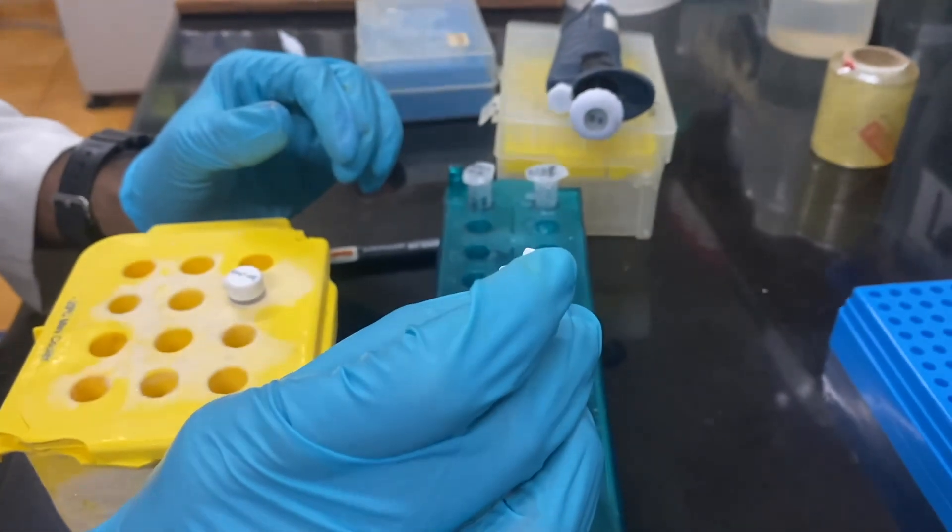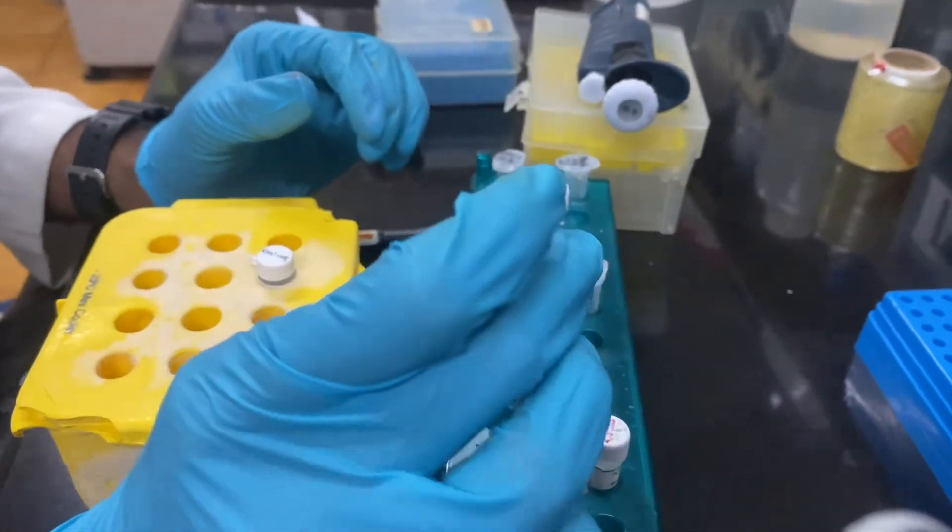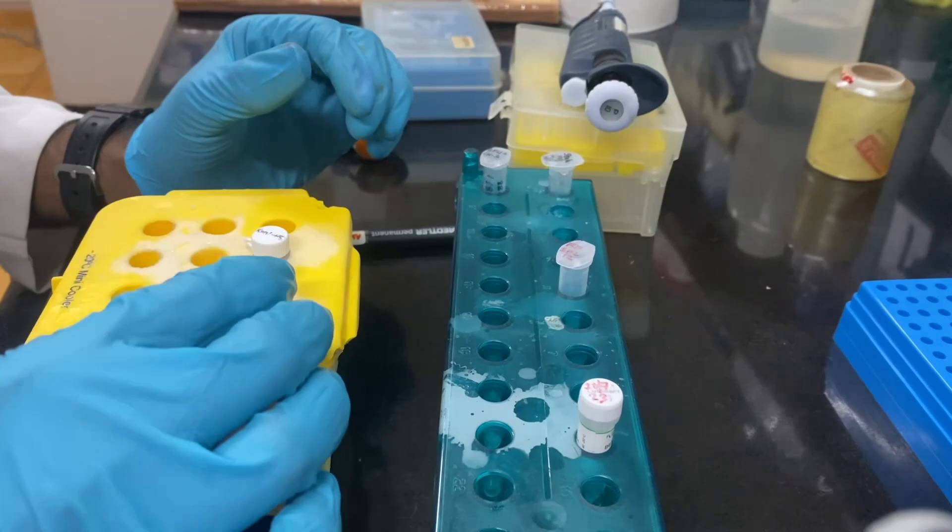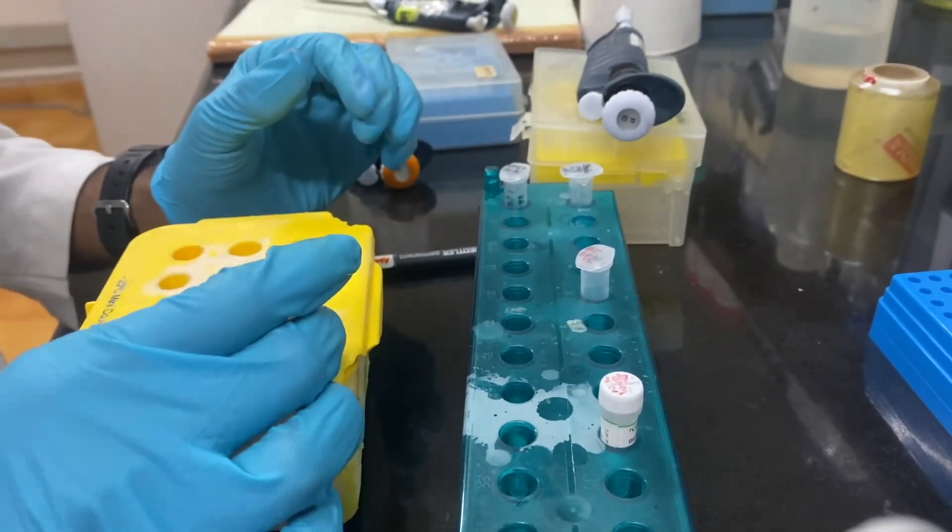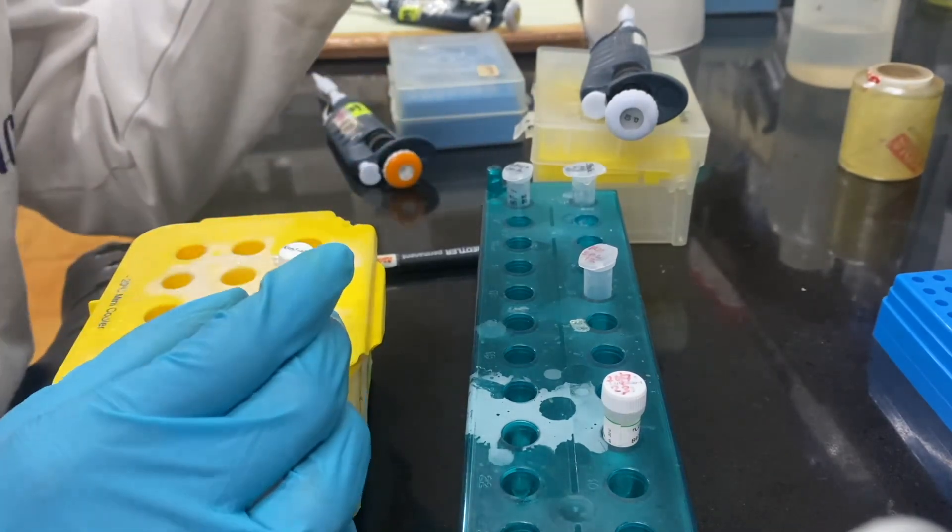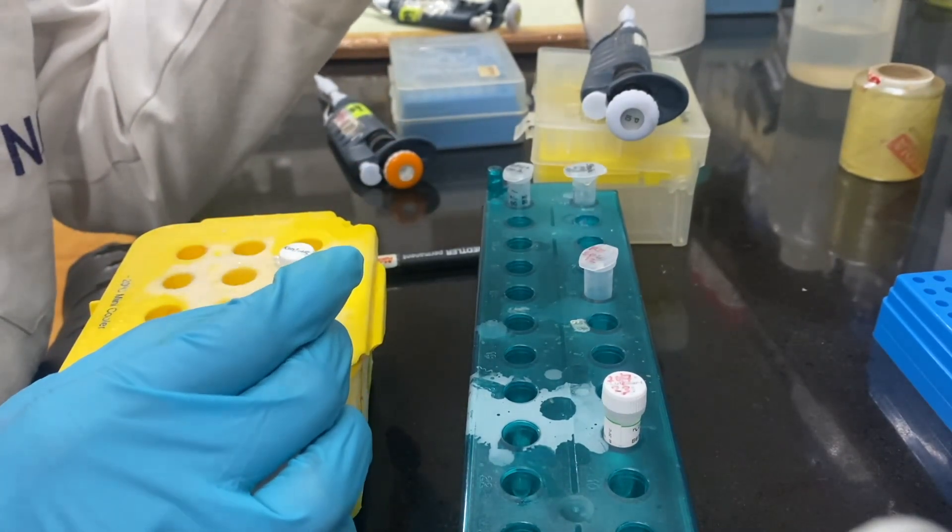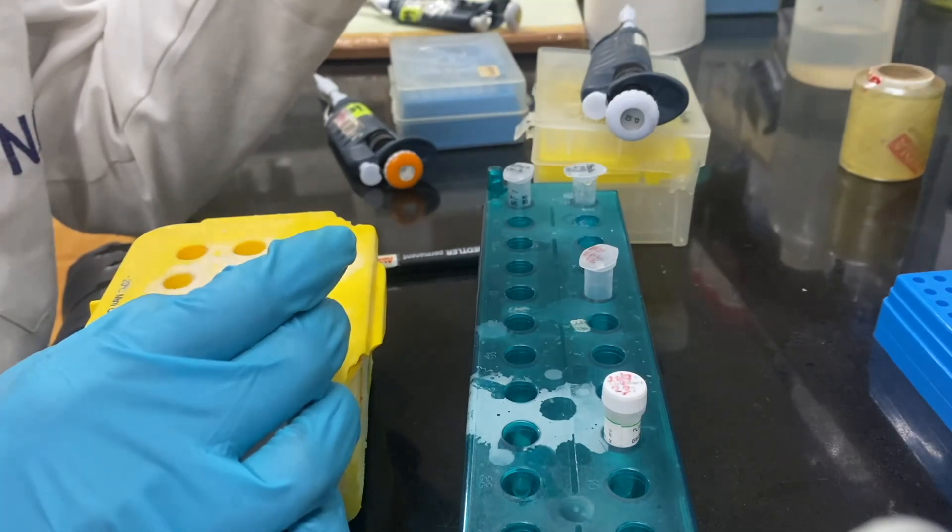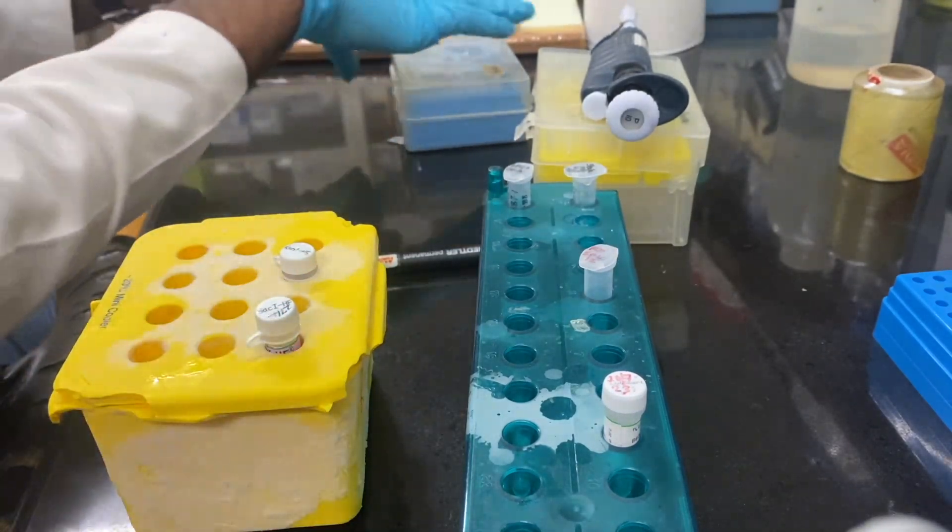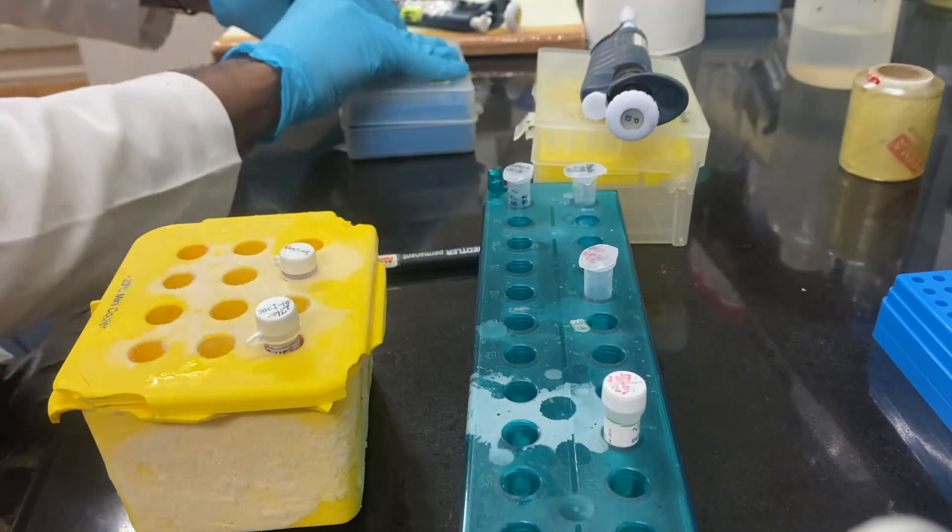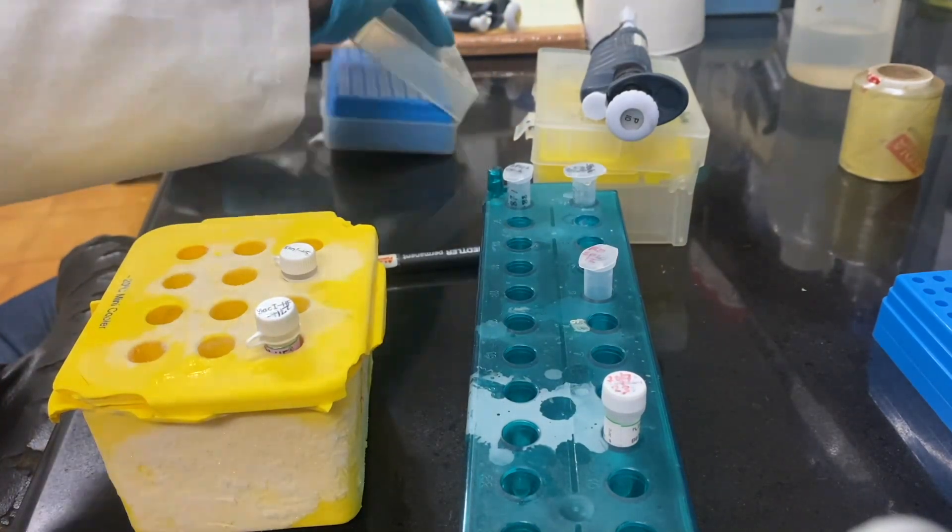This is 20,000 units per ml. So in one microliter it will be around 20 units. In this reaction we are going to add only 5 units to digest within one hour. For adding 5 units I need to add 0.25 microliter of Sac1 and KPN1.